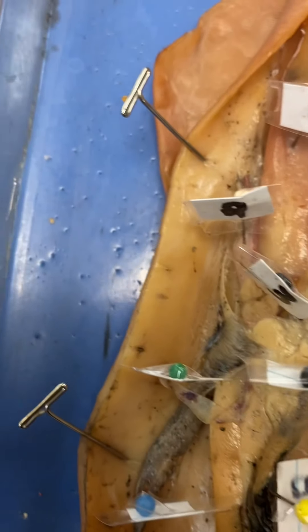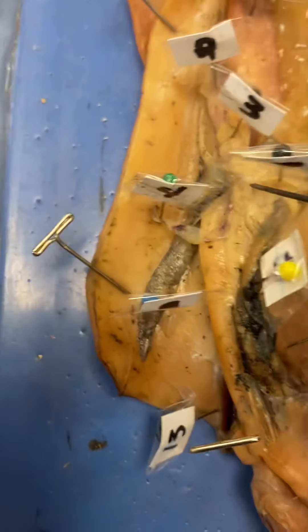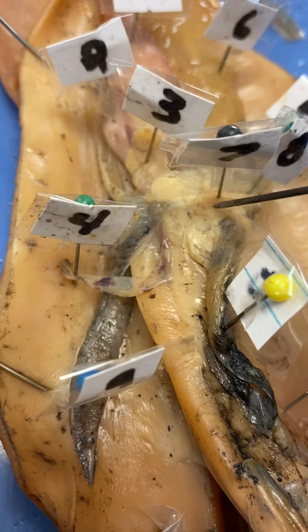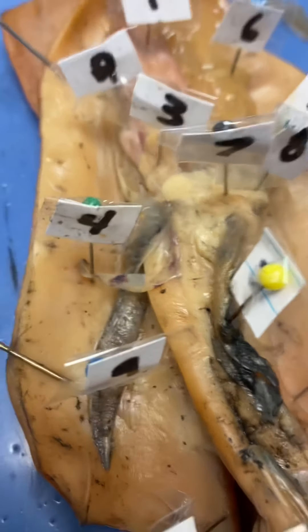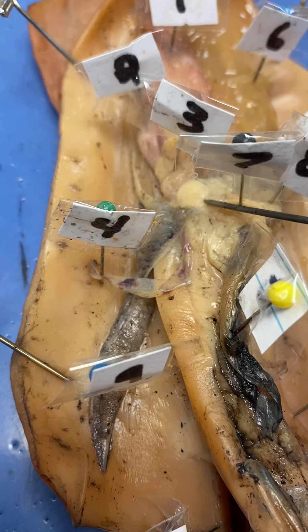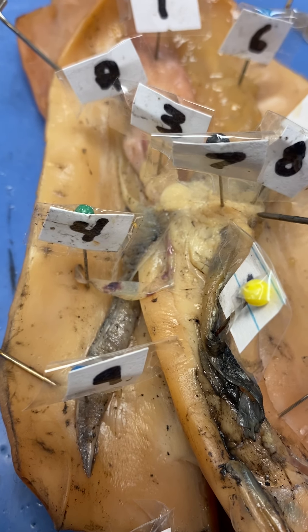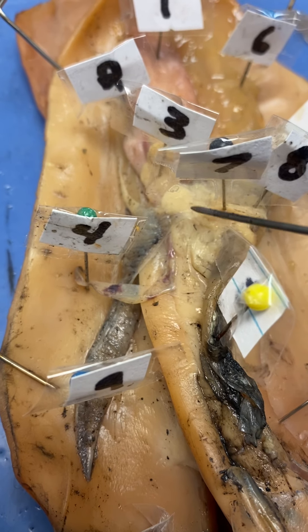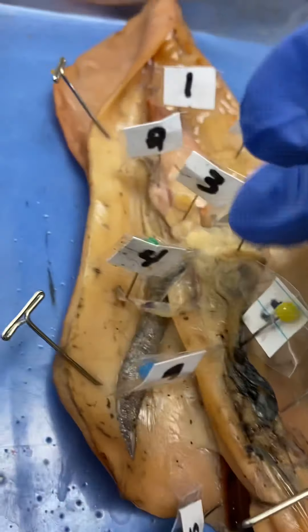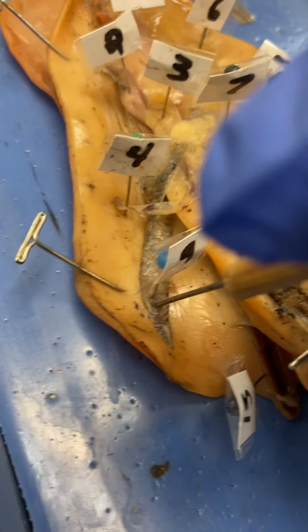Over here this jelly-like sac — it's a lot larger in this one but it's kind of falling apart — this is one of the digestive organs. This is the cecum, so this jelly-like sac is the cecum, and this one's kind of falling apart. Then right here, it's firmer and harder — that is the stomach. The stomach is connected to the cecum, and those are the digestive organs.